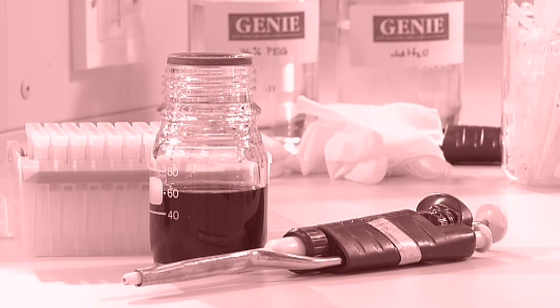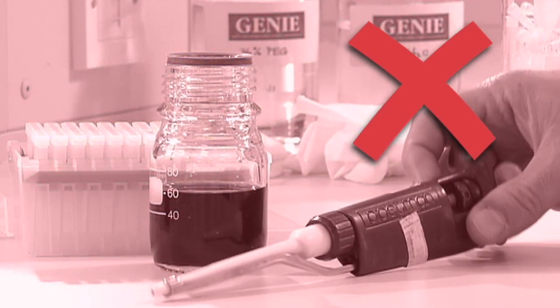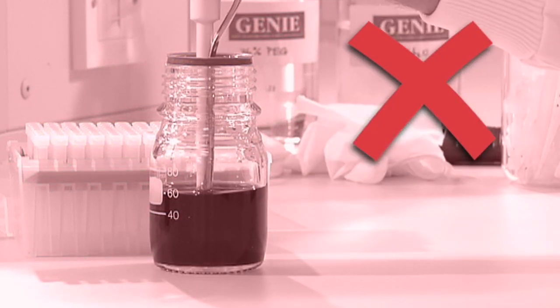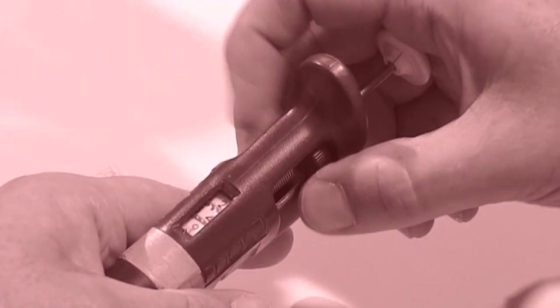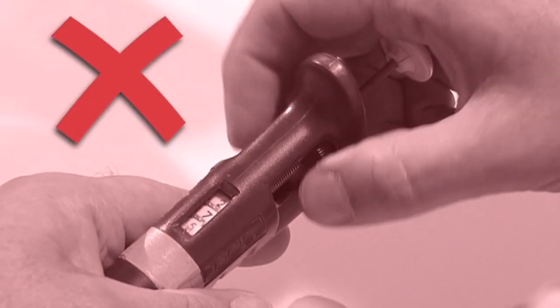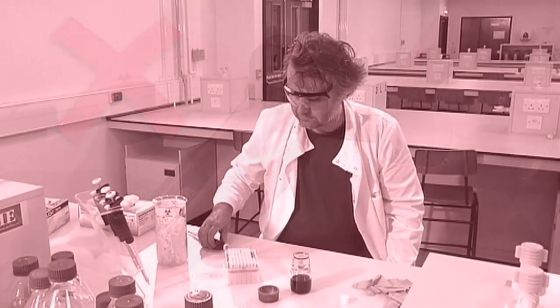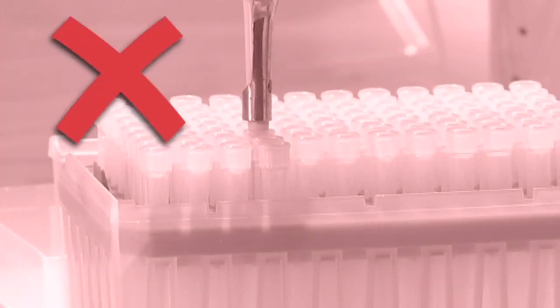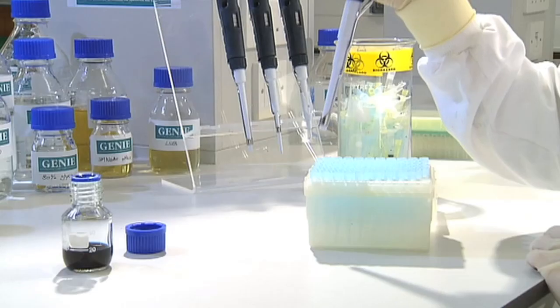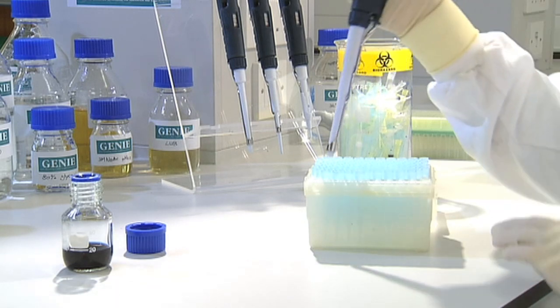Do not use a pipette without a tip attached. Liquid should never enter the body of the pipette — it will cause the pipette to corrode and will be a major source of contamination between liquids and experiments. Do not use a pipette past its volume limits, as this causes inaccuracies and damages the pipette. If you're having trouble attaching a tip, don't repeatedly jam the pipette into it, as this can damage the pipette. If the tip doesn't stay on, simply repeat the procedure with a new tip.